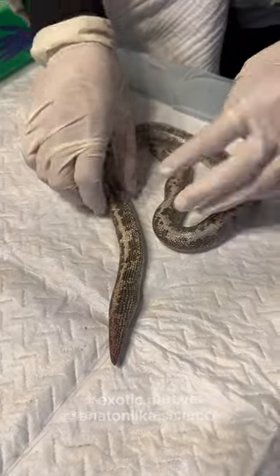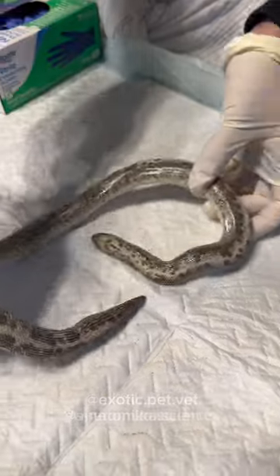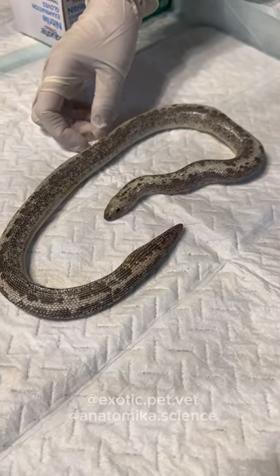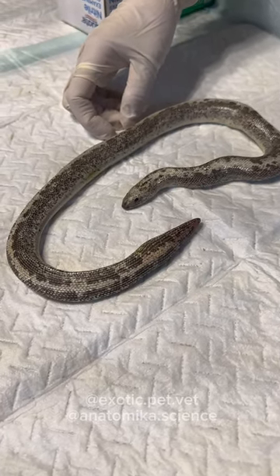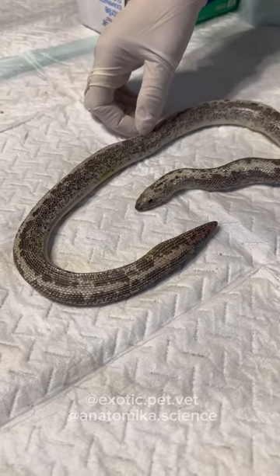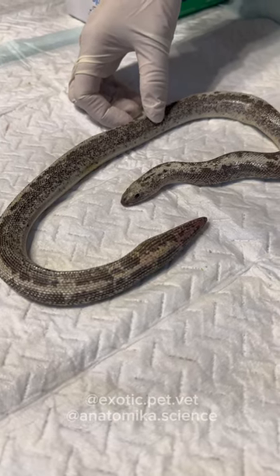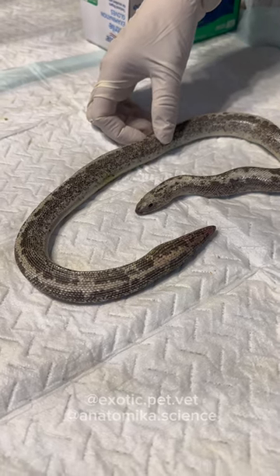Typically a snake has to be submitted within 24 hours for necropsy. If you freeze it or if it's older than 24 hours, your quality really lessens and you may or may not get adequate histopathology reports. I have submitted some that were older than 24 hours because maybe they died on Friday or Saturday and the lab wasn't open until Monday. But never frozen — freezing can certainly mess with histopathology.